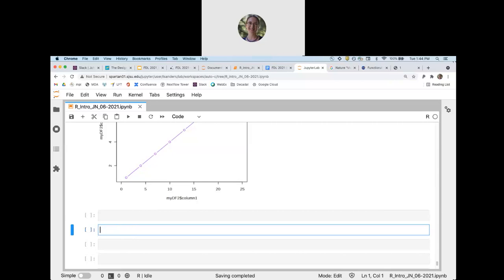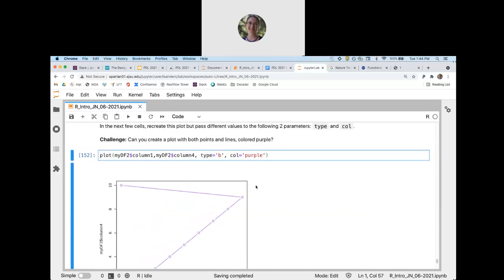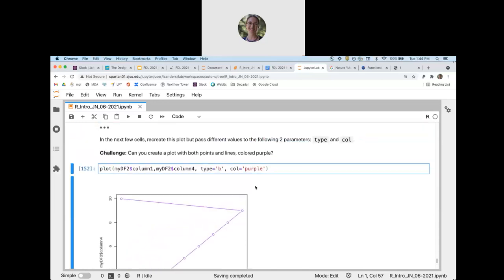I guess my question would be, if you have a big data set, and it's internally facing, and you're the scientist on it, the titles of the columns you can keep however. But if you wanted to make a presentation or give a poster, for example, and you wanted to rename them on your graph so that it looked nice and was very clear, is there a way to just do it for the graph, or would you just do it overall? I see. No, that makes sense. So you mean like you want your graph to have nicer titles here? Yeah, aesthetically, and to be able to communicate it clearly, to sort of spruce up our graphs a little bit. Yeah, no, for sure.